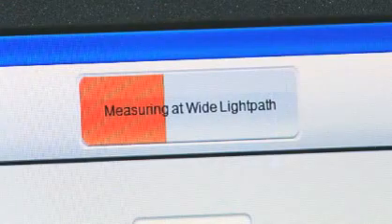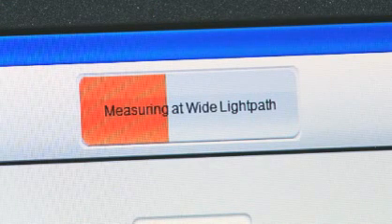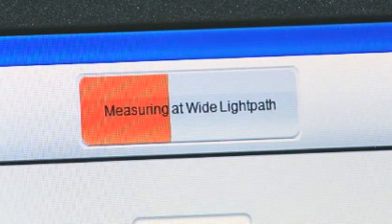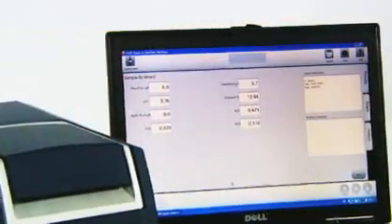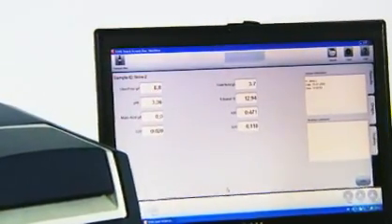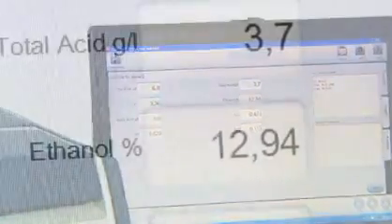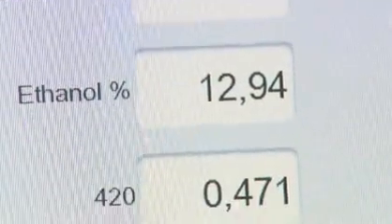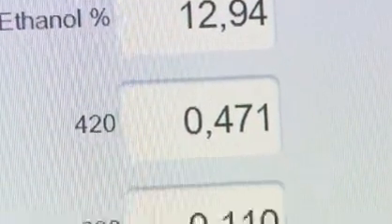You can then keep an eye on the progress of your measurement. And in no time, you'll have your results for both the wine and the color analysis.